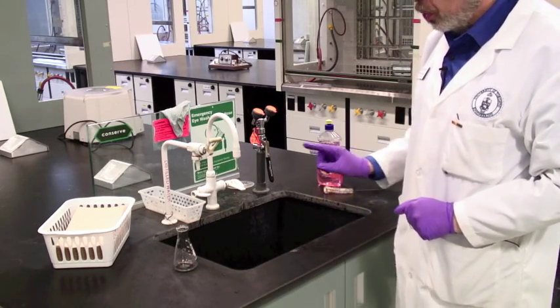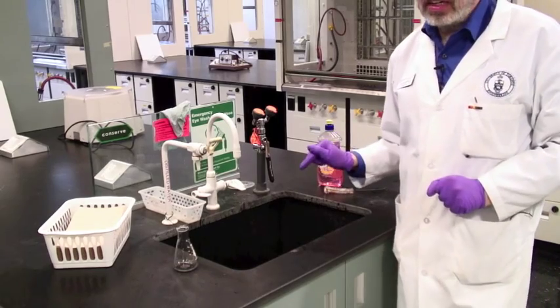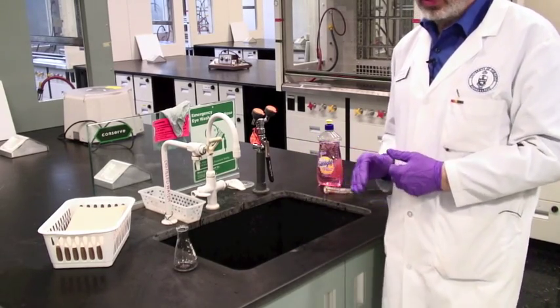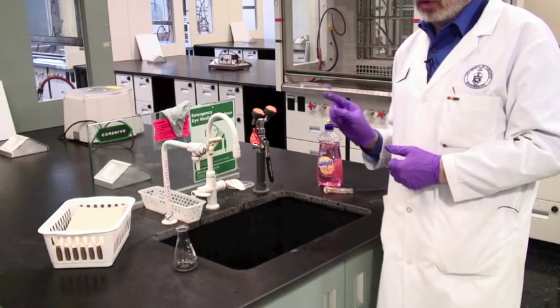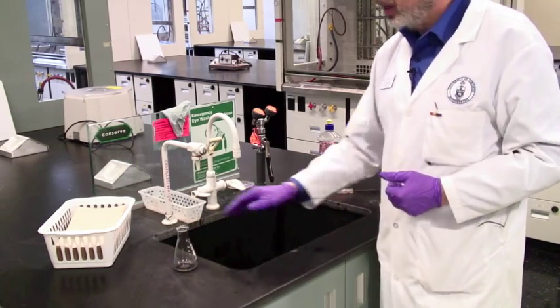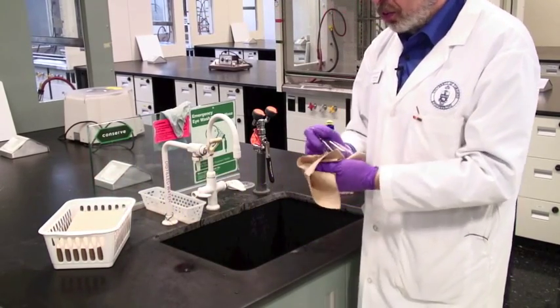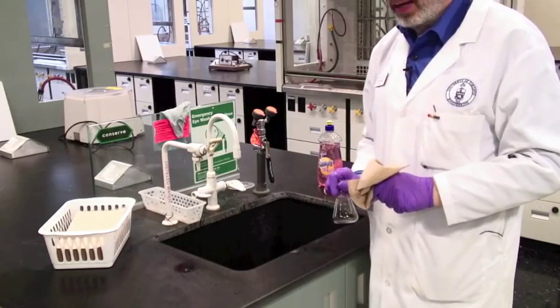I should also point out that there is one sink for 16 people, so you'll need to be doing the dishes all the time, and don't leave it until 5 to 5. There will be far too much of a crowd here. This is also where you'll find paper towels, and you can use this for drying, but you'll also need the paper towels for cleaning up.